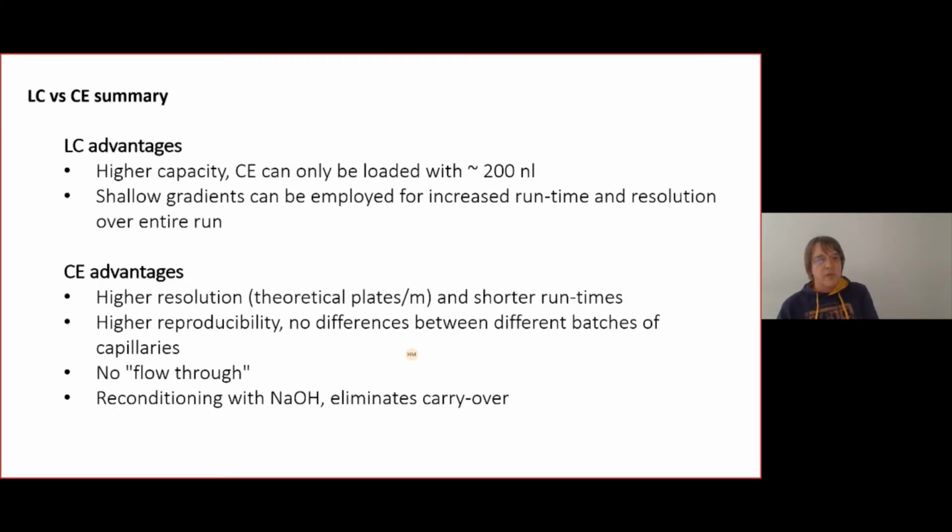The advantage of the CE is the higher resolution, but much more even the higher reproducibility, that there is basically no difference between different batches of capillaries. We by now used this for more than 15 years, and we can still compare the data from 15 years ago to nowadays data. There is no flow through, and we can clean the system, eliminating carryover.